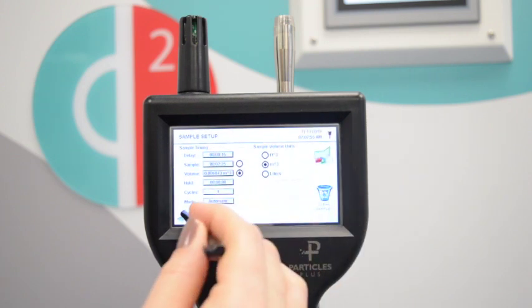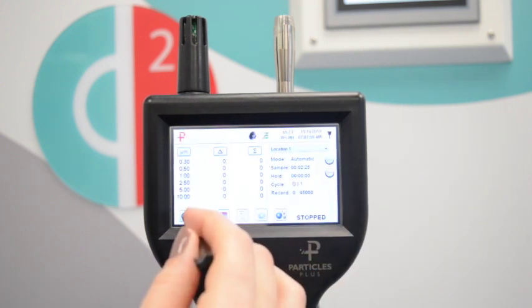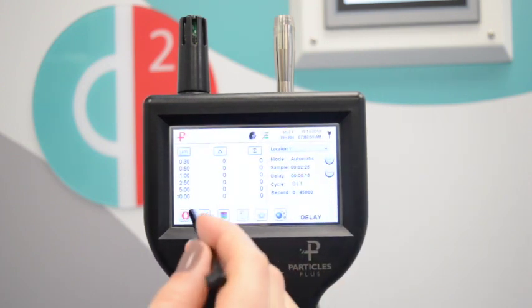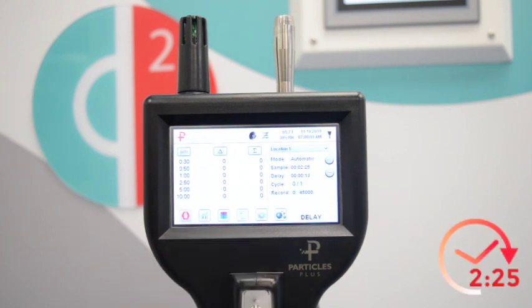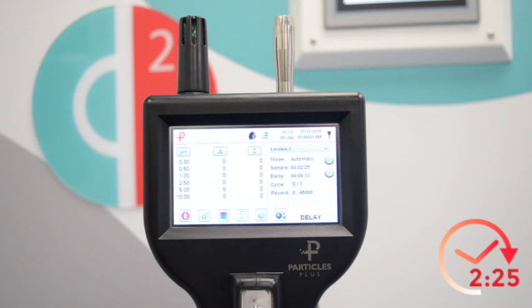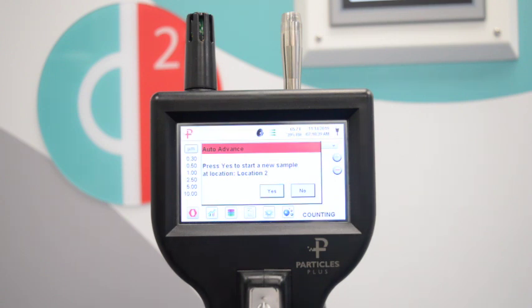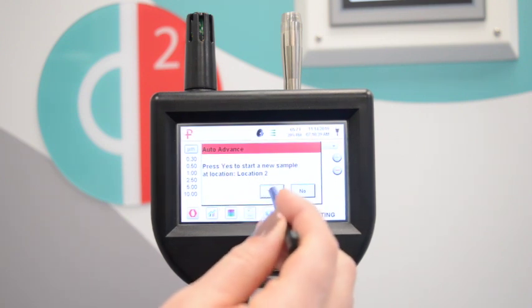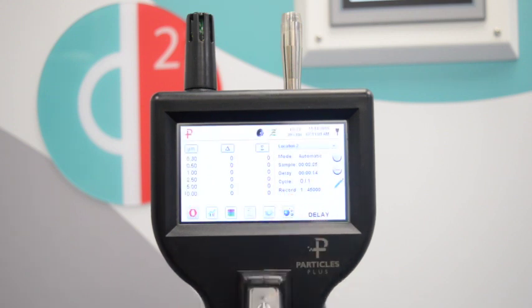And now we will start the sample. Now this count has finished it will automatically move to location 2 and ask if you'd like to start sampling again. Once you press yes sampling will begin.